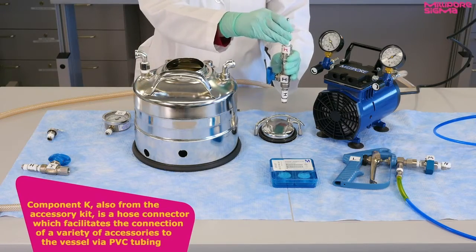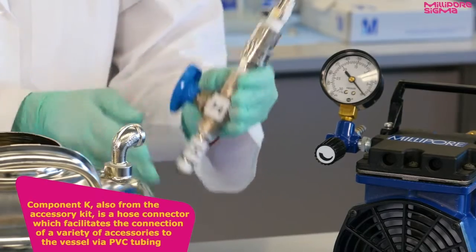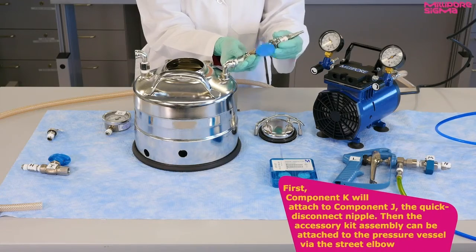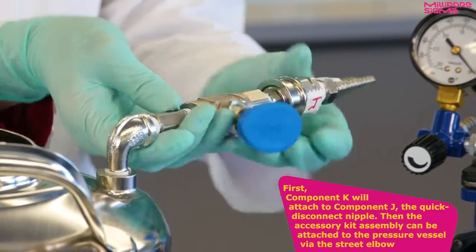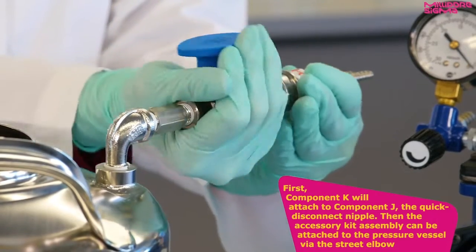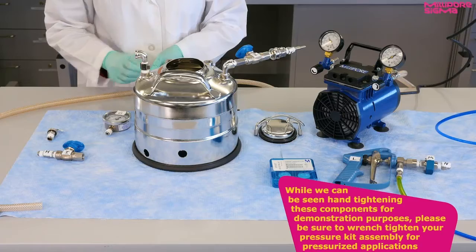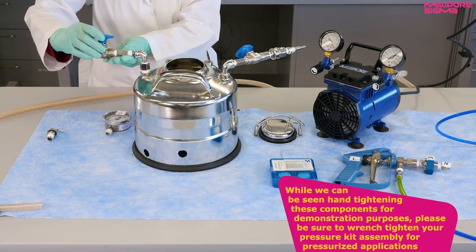Component K, also from the accessory kit, is a hose connector, which facilitates the connection of a variety of accessories to the vessel via PVC tubing. First, component K will attach to component J, the quick disconnect nipple. Then the accessory kit assembly can be attached to the pressure vessel via the street elbow. While we can be seen hand-tightening these components for demonstration purposes, please be sure to wrench-tighten your pressure kit assembly for pressurized applications.